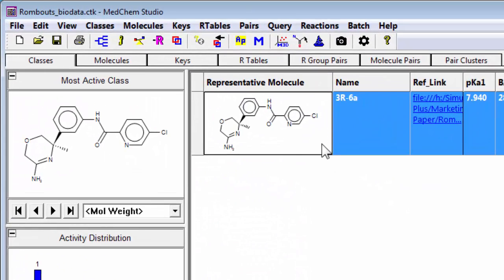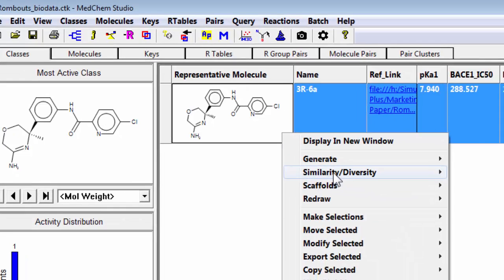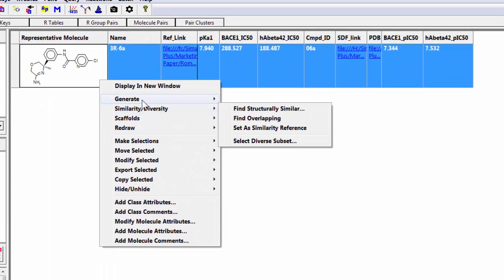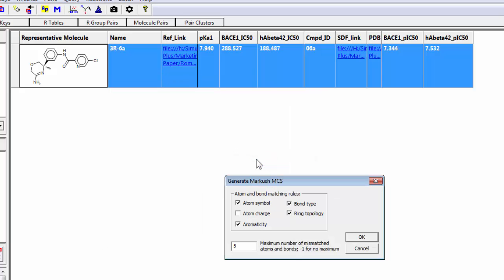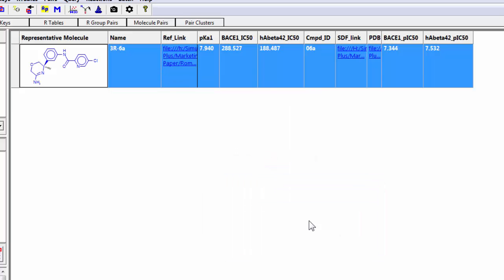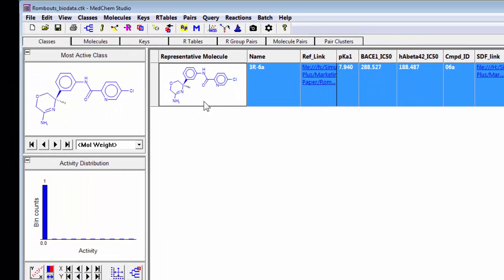The next thing I'm going to do is create a maximum common substructure, so I'll go generate Marcouche MCS. You'll see that I'll just take the defaults and it's highlighted all the atoms in the molecule.